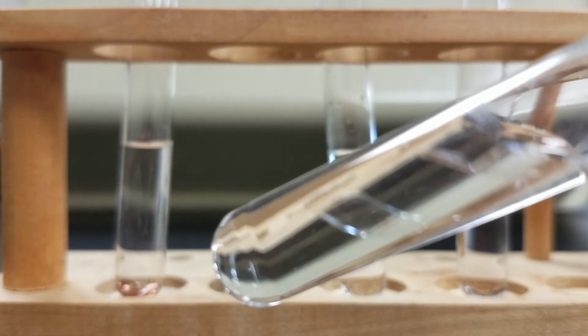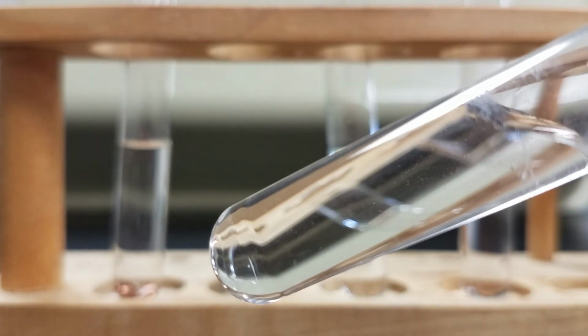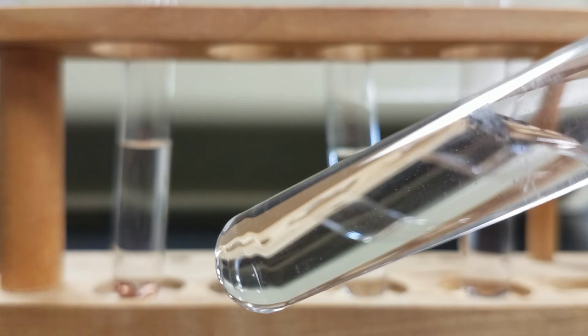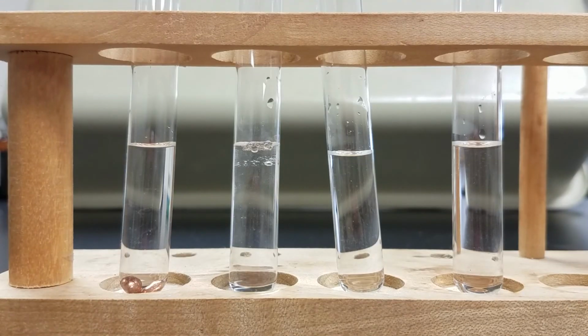You might even be able to hear it. I'm trying to focus in on it. There we go. You can see some bubbling that's taking place. You can hear it if you listen very closely. So we definitely have a reaction with the magnesium in the zinc sulfate.